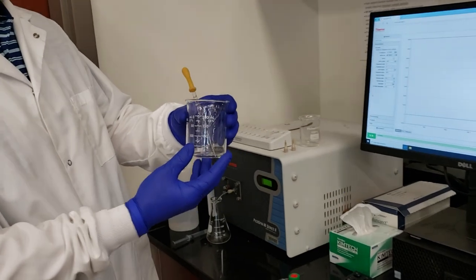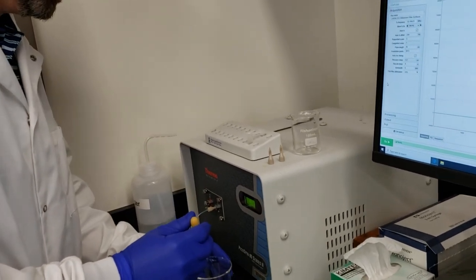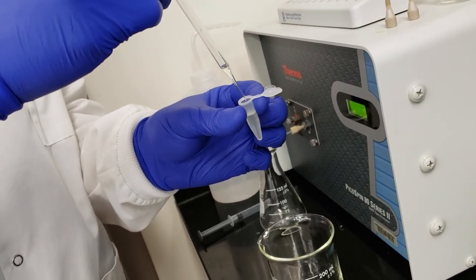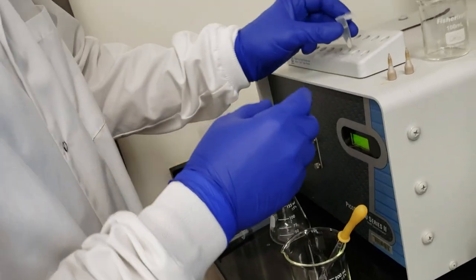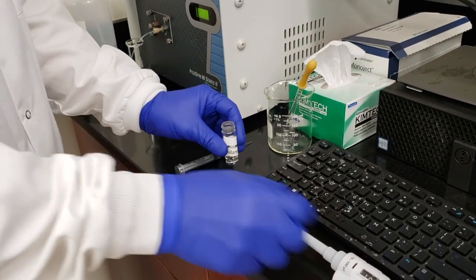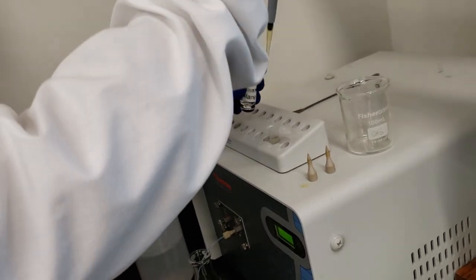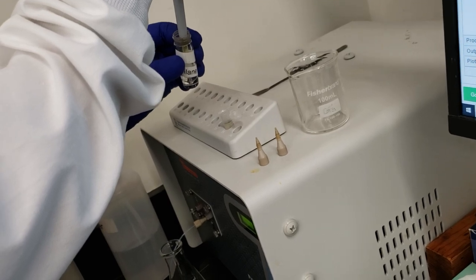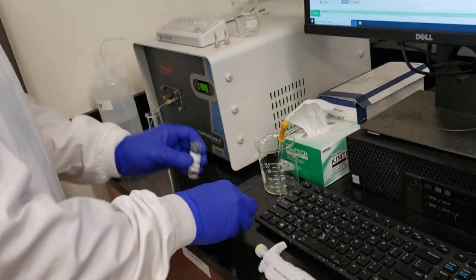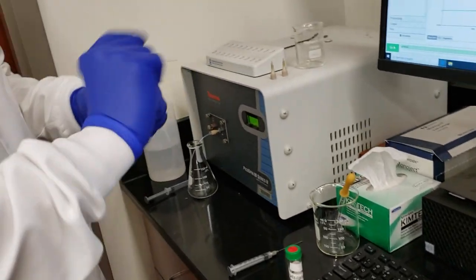We brought our product over to the PicoSpin, our desktop NMR unit. I'm going to go ahead and draw up some of our product here and place it in our Eppendorf tube. That'll be plenty for what we need. Set this aside. So we have a liquid this time, so we don't have to worry about dissolving it in deuterated chloroform, but we still have to put in our TMS. Didn't get much in there. Hold on one sec. All right, there's our TMS, so that's going to give us our standard. Cap this and give it a shake.